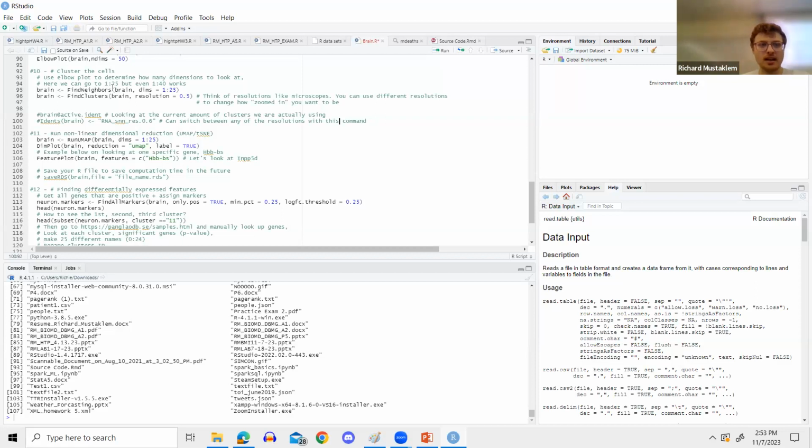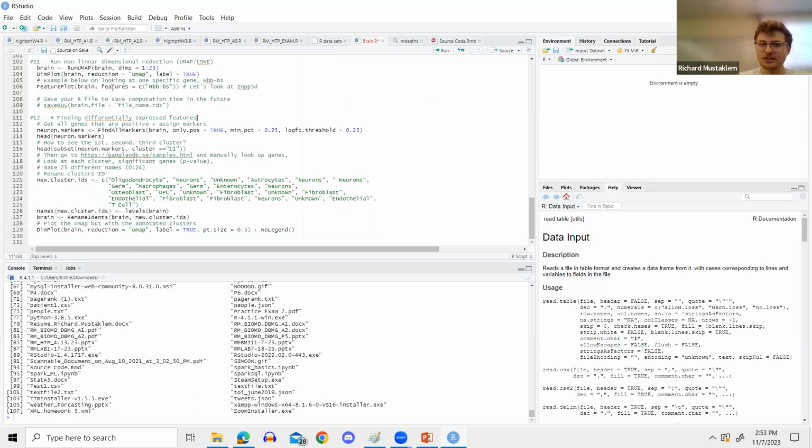Anyways, we're gonna run these two lines, DimPlot label equals true, and that will label everything. We have 7 minutes to talk about annotation. We're almost done. We didn't get to any data analysis part yet, but this is the final step before data analysis. So this is called annotation.